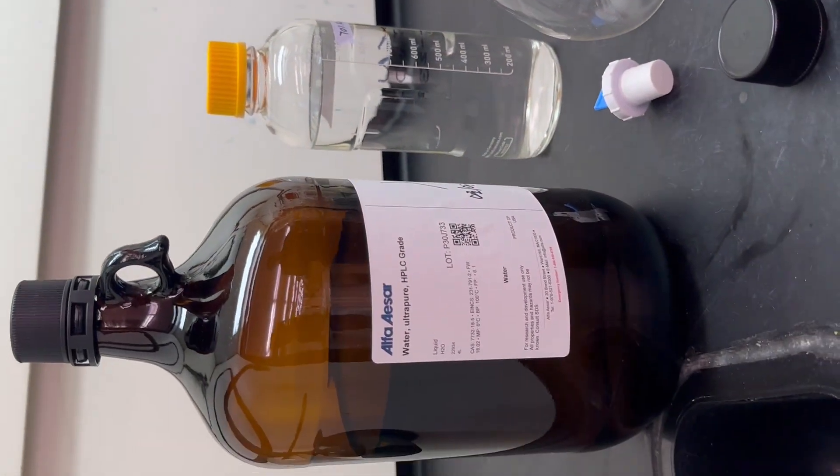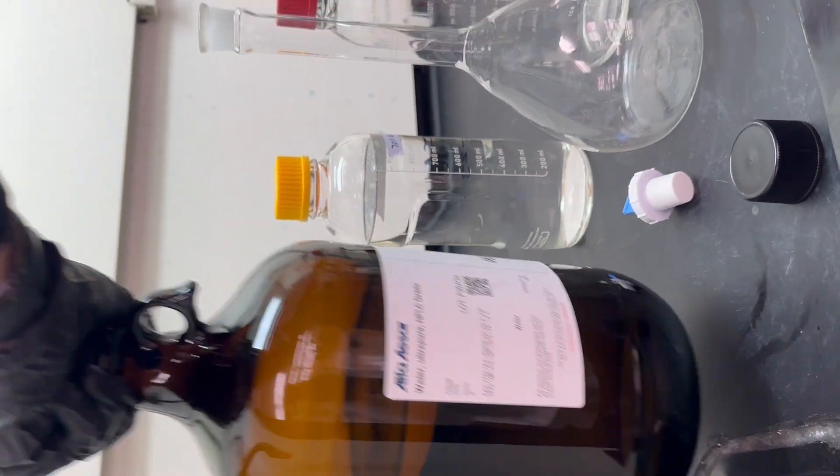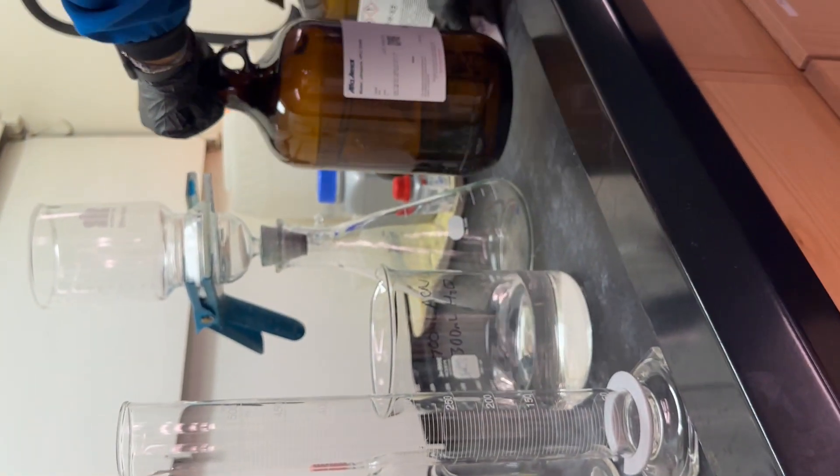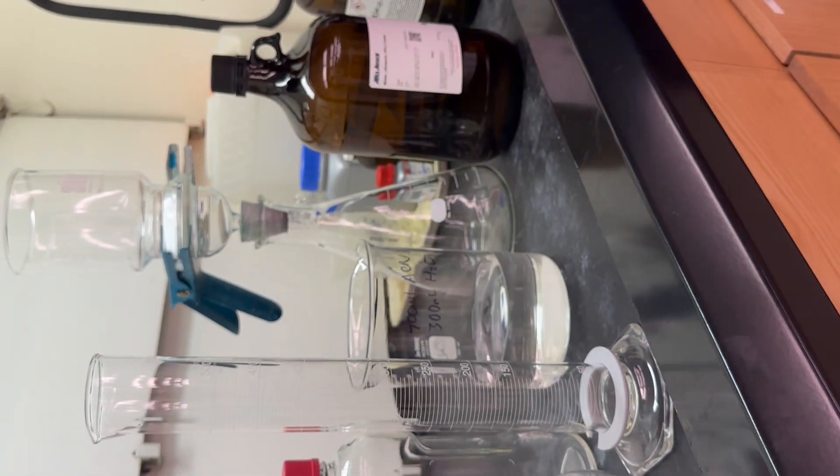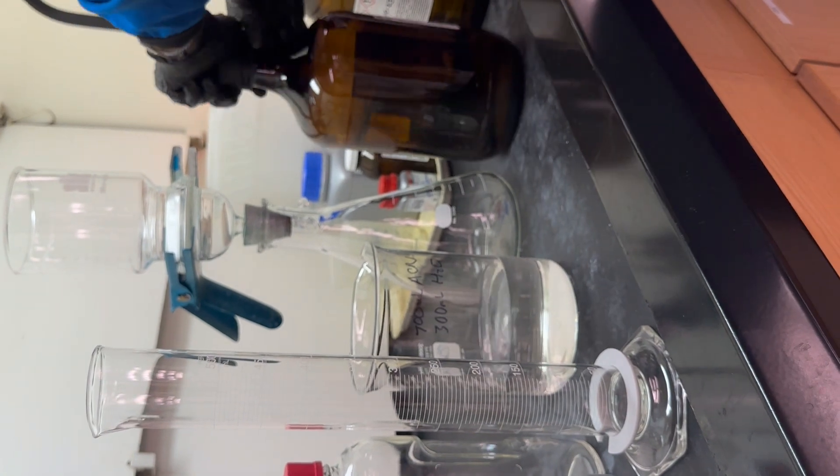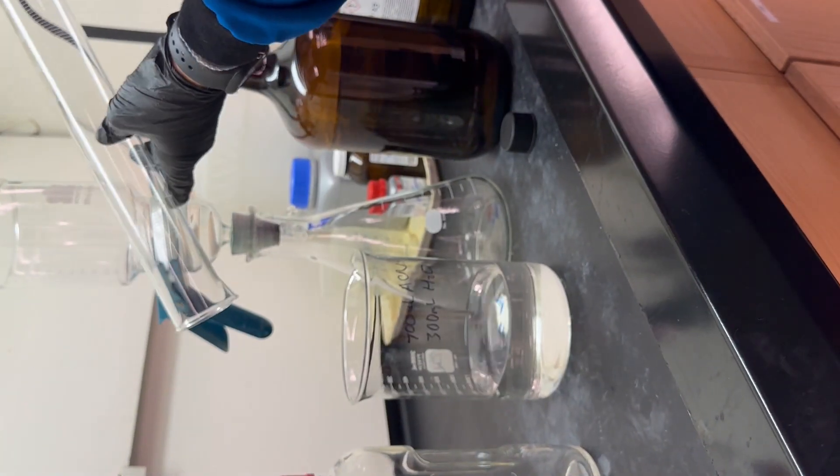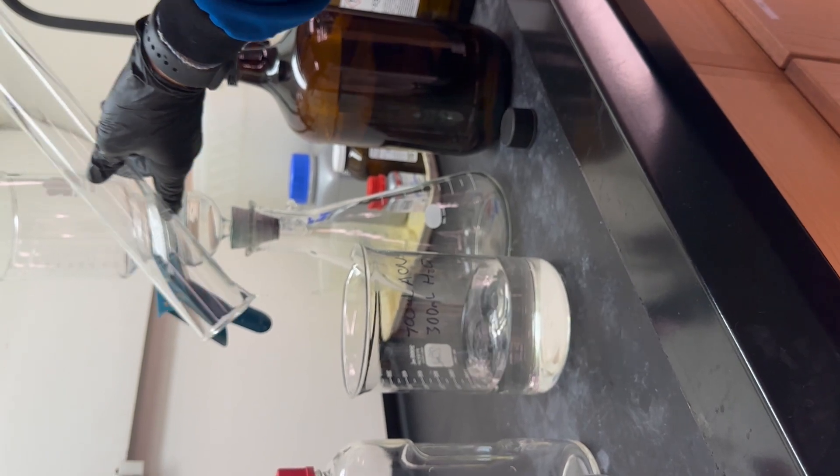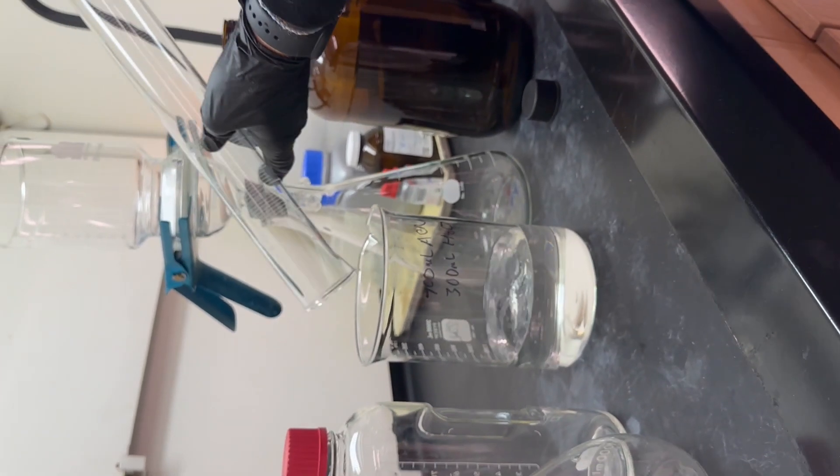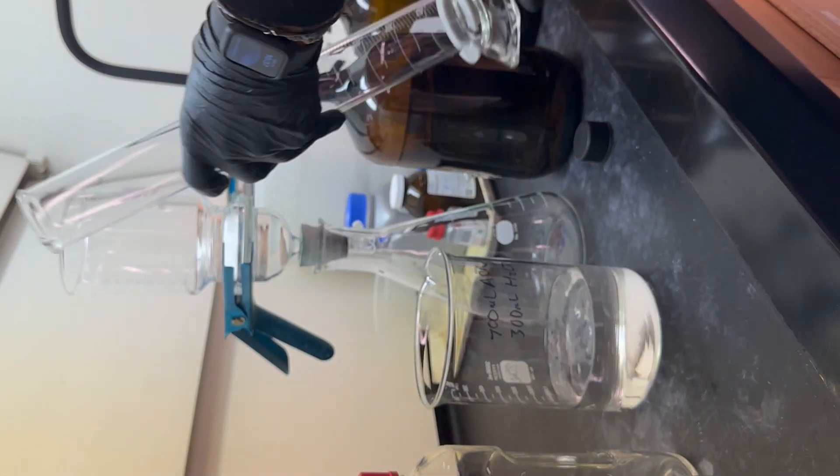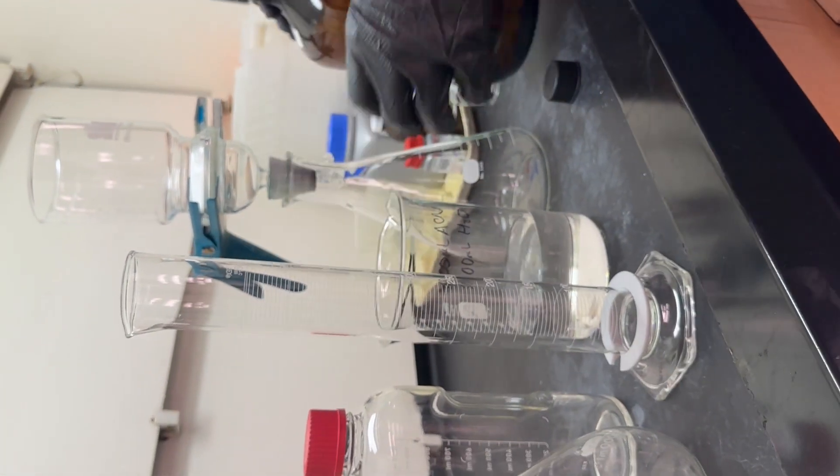Now we can go ahead and get our 300 mLs of our HPLC grade water. Make sure there's no extra volume in here from that ACN. Again, negligible quantities, but try to be perfect. Do what you can do. 300 mLs.